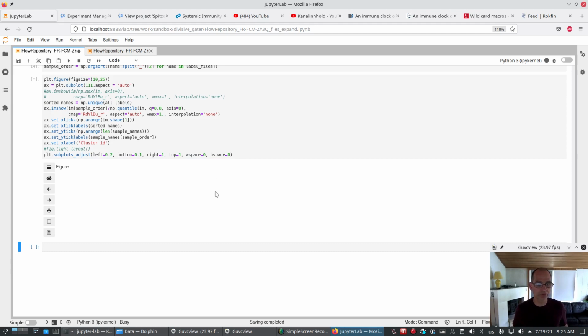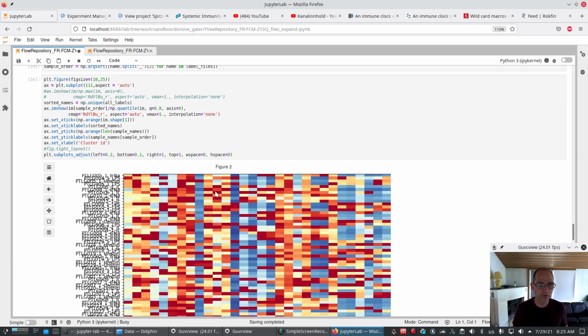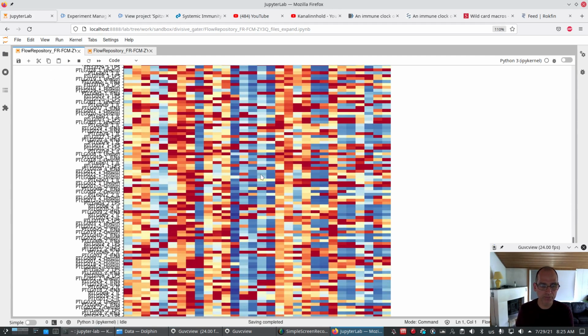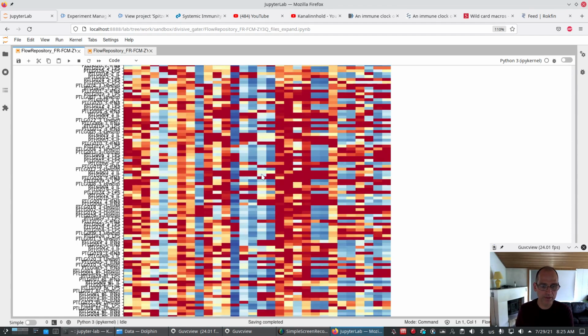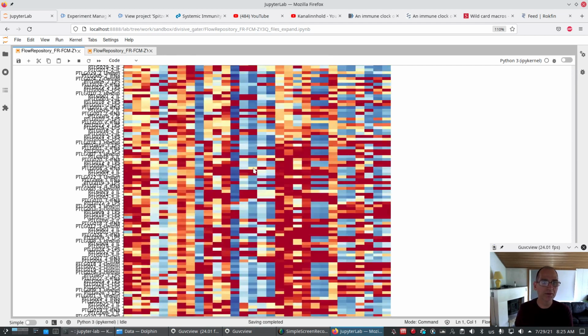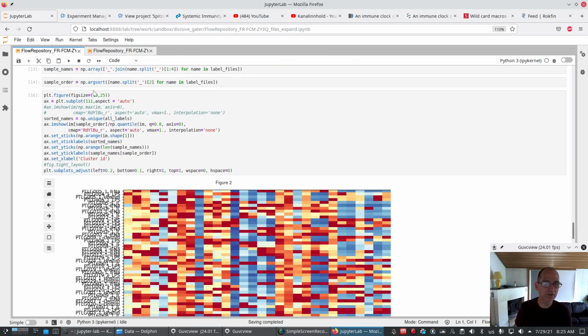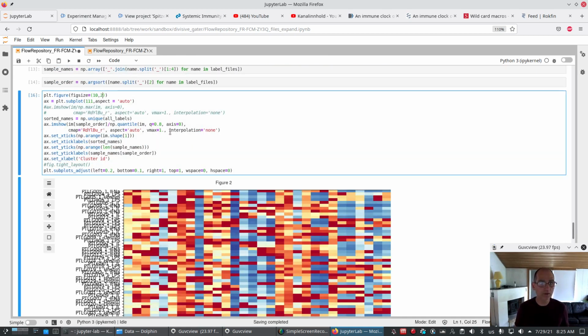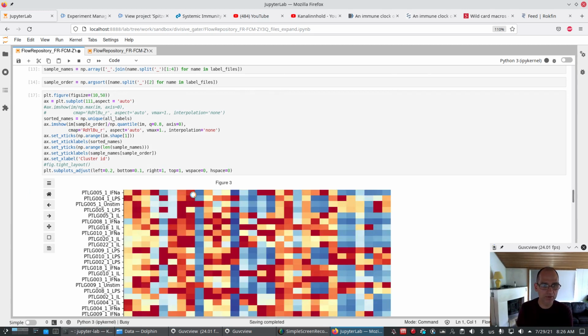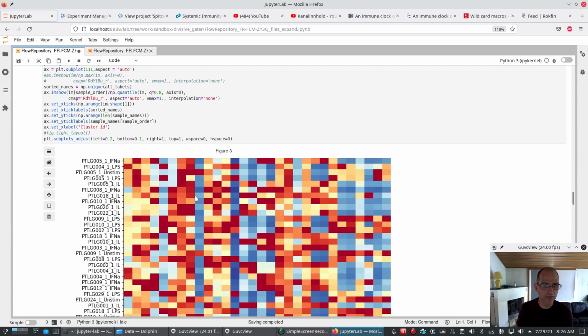And now it's not going to fit on the screen. That's a different issue. It wasn't big enough. I make it even bigger. Twice as big. So that's the problem with having a lot of files, and it's not going to fit on the screen. And maybe the file names are not the ones we want.